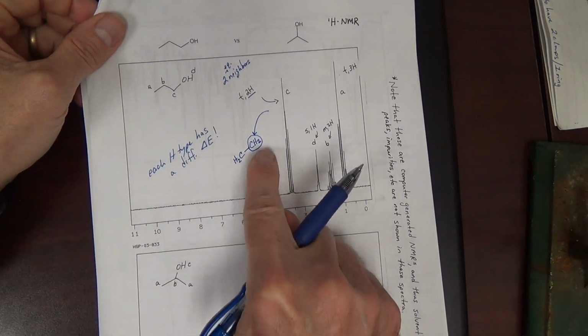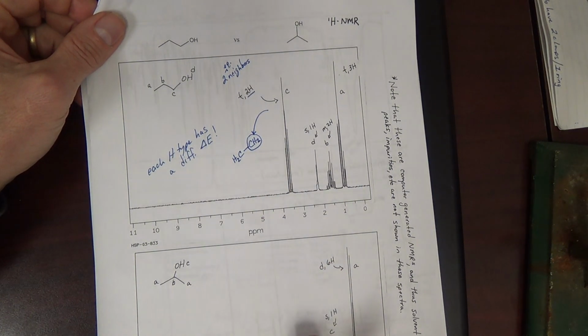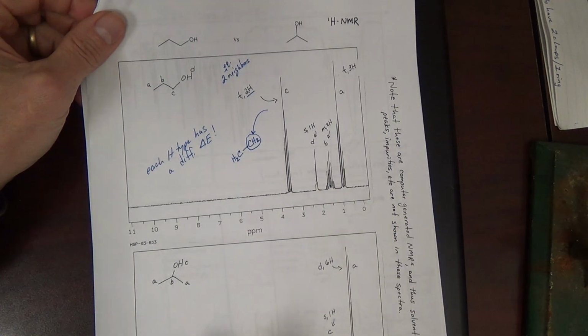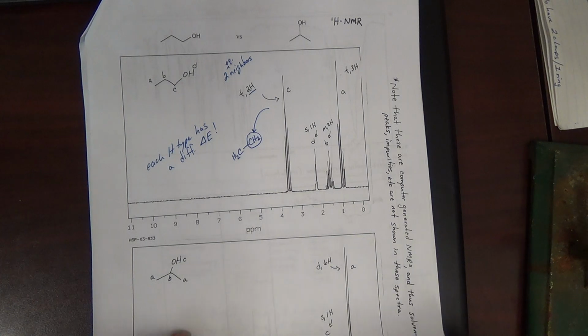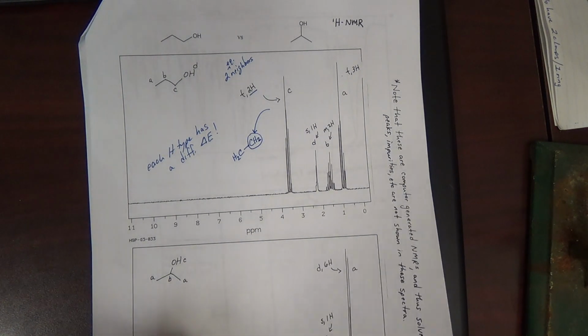But that signal also tells us what the neighbor looks like. All right? That's the power of the splitting in your NMR. We'll talk more about that once we start doing problems, solving structures.